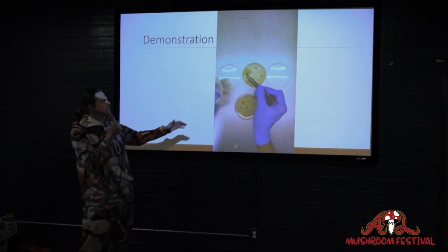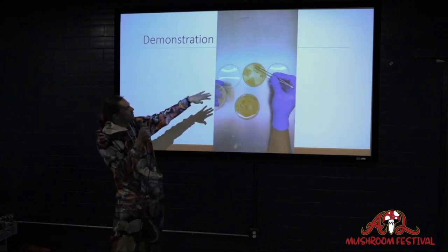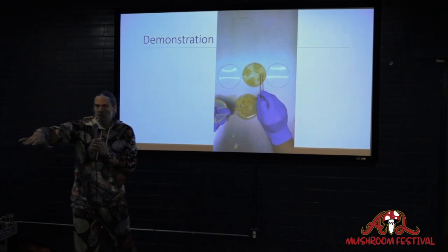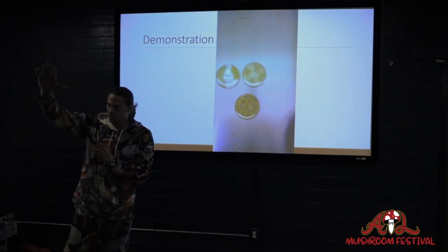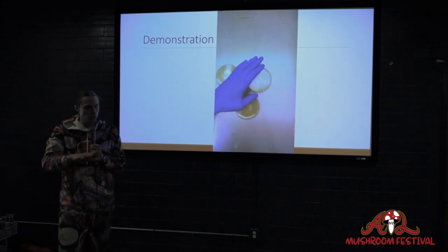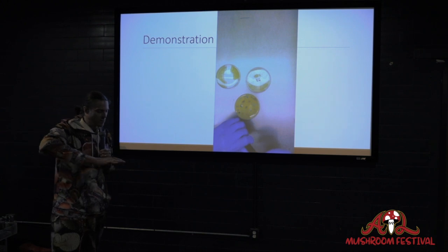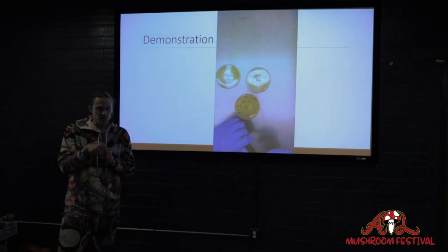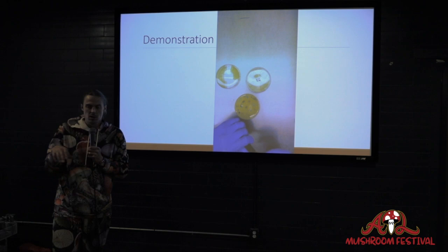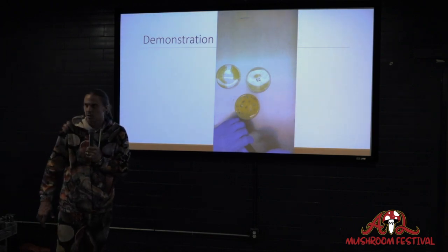And so one thing to note is, as I'm placing these cover slips over it, notice that I'm not sliding the cover slip around. It's going immediately directly over the hole, and then I'm pressing on it gently to remove air bubbles. But you don't want to slide that cover slip around, because if there's any bacteria around the edge of that cover slip, you're going to smear it all around that cabin, and then the cabin's not going to work.